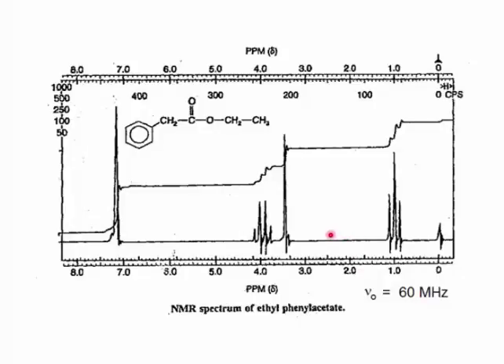So we're going to estimate 3.95, and the other estimate we had was, I think, about 3.9. This is 3.95. They're too close together to really be able to decide which of these signals corresponds to which methylene. But what's going to give us our answer here is the splitting pattern. Let's now analyze the splitting pattern in this molecule.